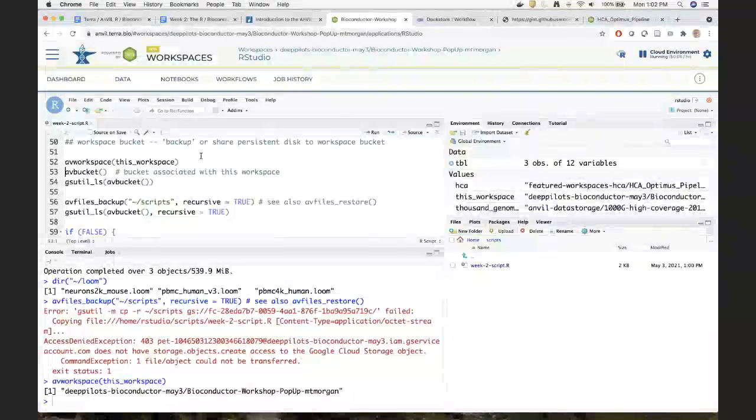And it was so fast, it seems like, to the extent that you might want to just delete that disk if you're going to put it aside for a couple of weeks. Yeah, maybe that's a good strategy, sort of money management. I mean, the disk costs, it's a small disk in some ways, like 50 gigs is a pretty small disk, so we'd fill it up pretty quickly. But it's not super expensive either.